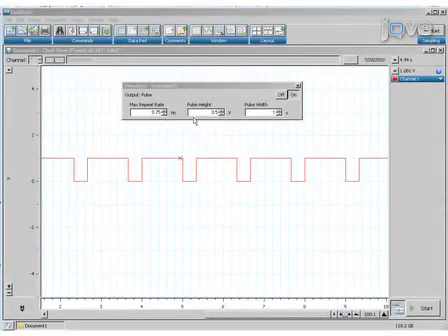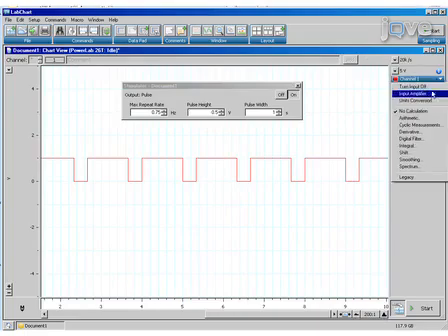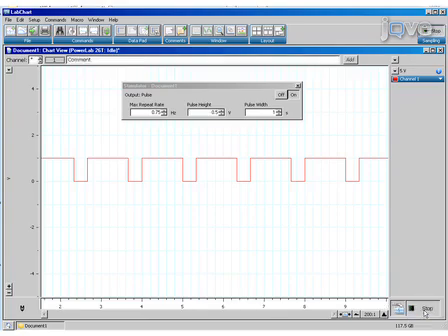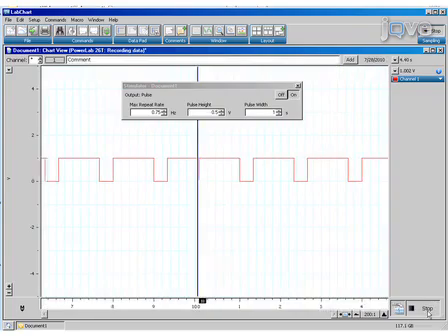On the computer, set the stimulator to use 1 second, 1 volt, which is a 0.5 volt amplitude setting, and 0.75 Hz pulses. Also, in the upper right-hand side of the panel, set the acquisition rate to 20K per second. Next, click on channel 1 at the right-hand side of the screen. Click on Input Amplifier. In the box, click on the differential button and set the range to 5 volts. Click OK to save these changes. Click Start to begin collecting data. Measure the data at the same points along the breadboard.